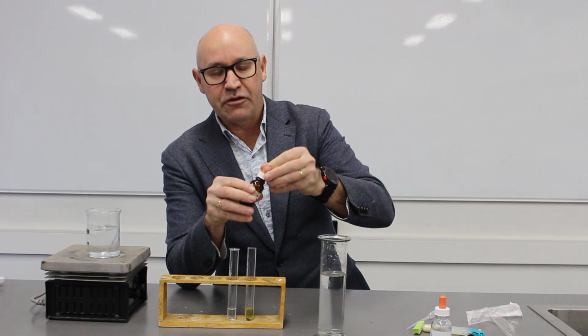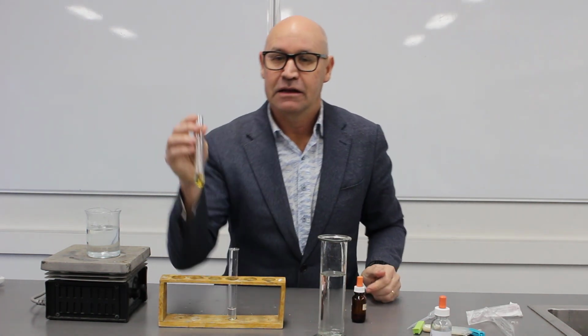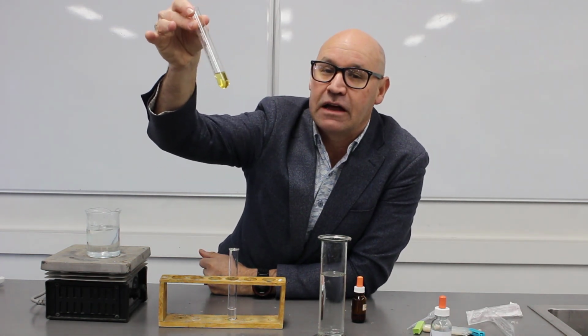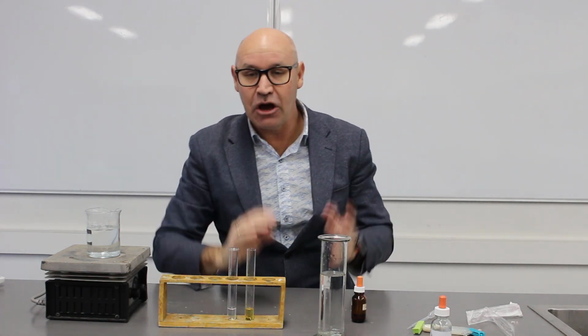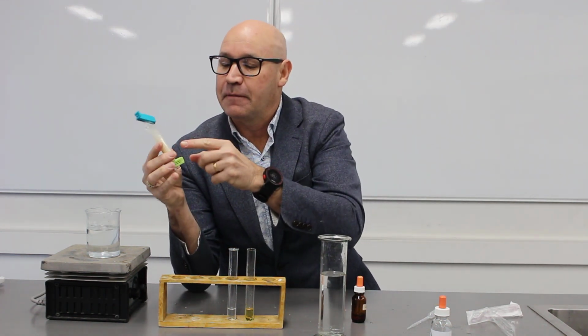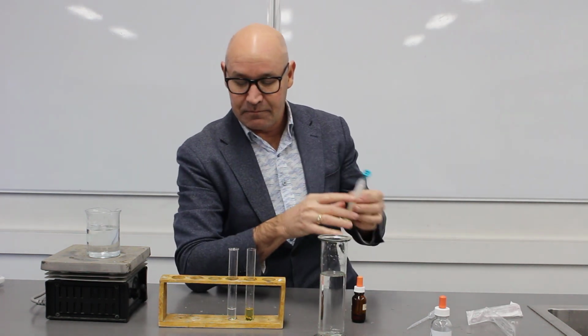You'll recall that the positive test for starch is the blue-black colour, really quite a dark black, whereas now this is just the colour of the iodine. So that means this is a negative test. What does it mean? It means that no starch has been able to go through the small holes in our dialysis tubing to be able to get out into that water.